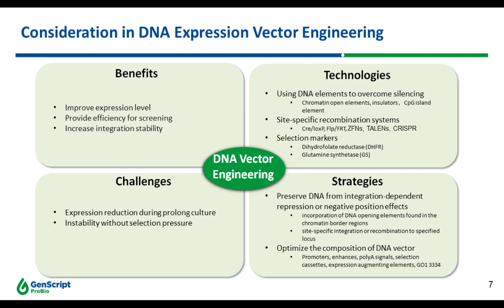ClonePix is an instrument that automatically images, selects, and picks clones. It's high throughput and industry proven, and can select clones with extracellularly secreted protein in semi-solid media, so it can actually screen for clones with high productivity. But its throughput is not as high as FACS.